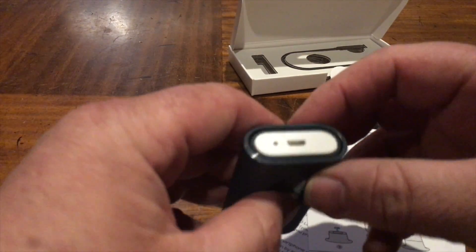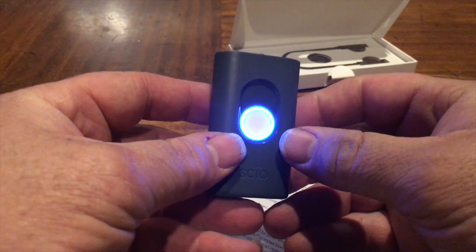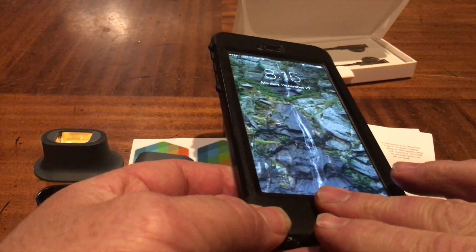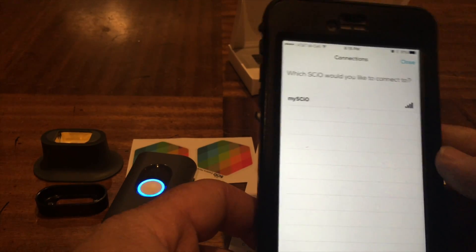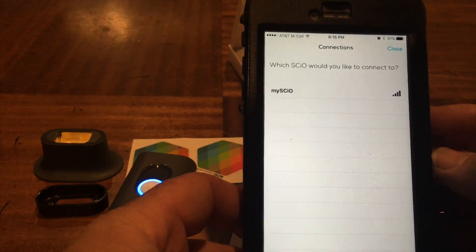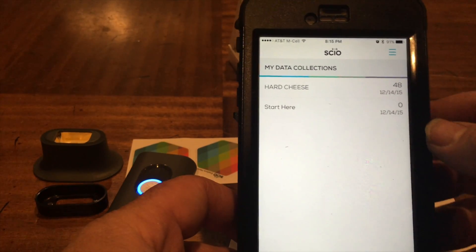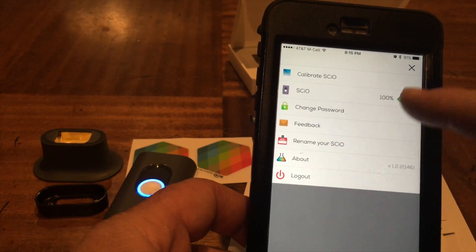We're not going to wait two hours because we want to get to playing. It turns on with a flashing ring. Let's see what the app does here. It seems it's your first time - I want to connect to that one. It's kind of anticlimactic - 100% battery, 100% calibrating.